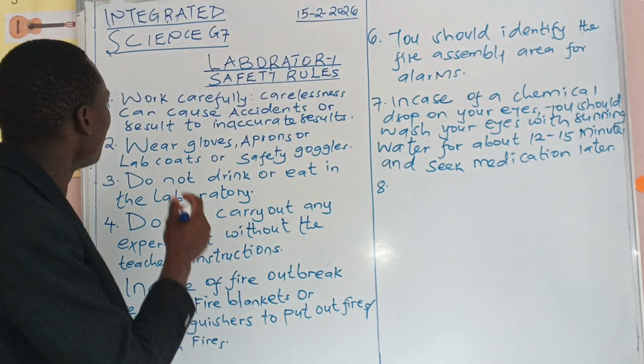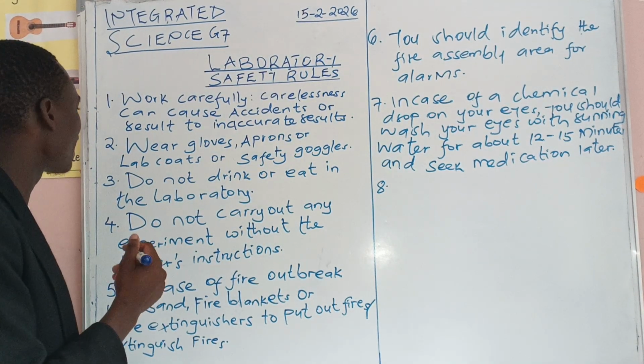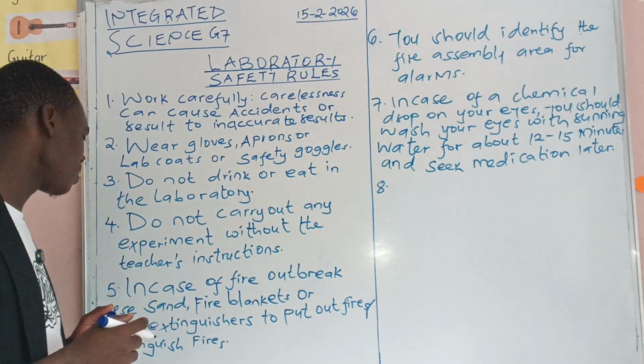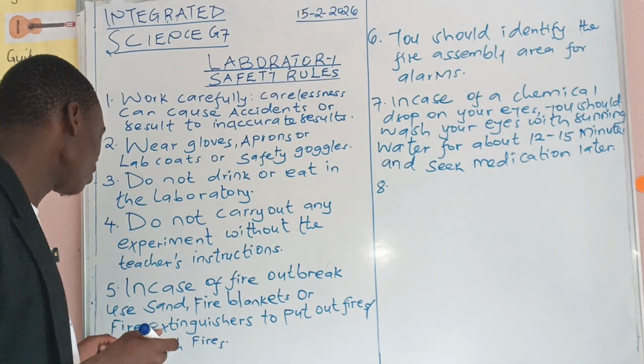Now, number 1, we work carefully, wear gloves, do not drink, and do not carry out any experiment without instruction in case of fire outbreak.